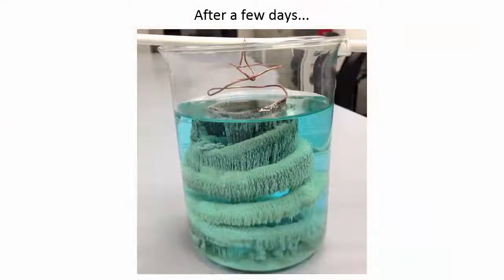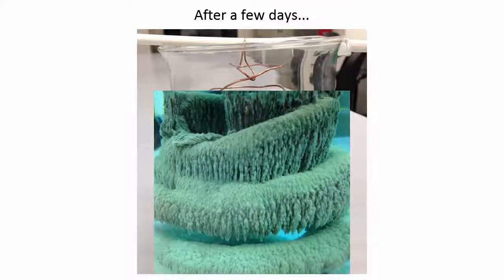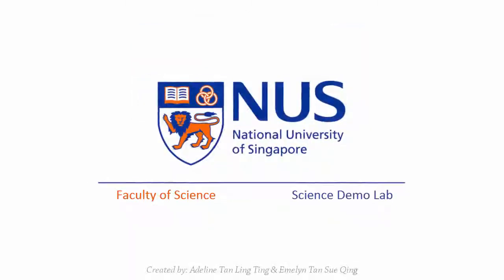After a few days, more crystals can be seen on the copper wire. Moreover, the silver crystals are soft enough to be scraped off easily for collection. Have fun with the silver tree experiment!